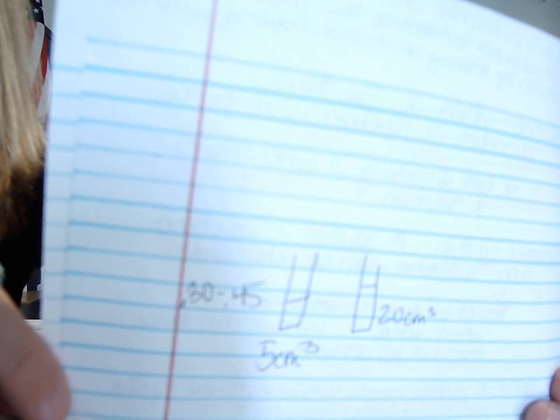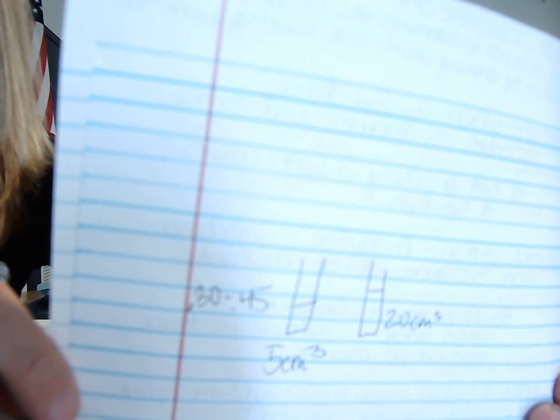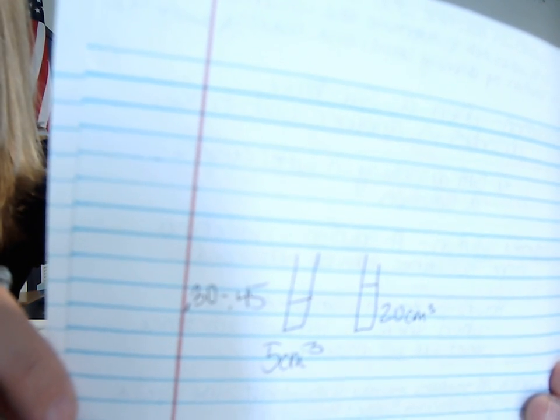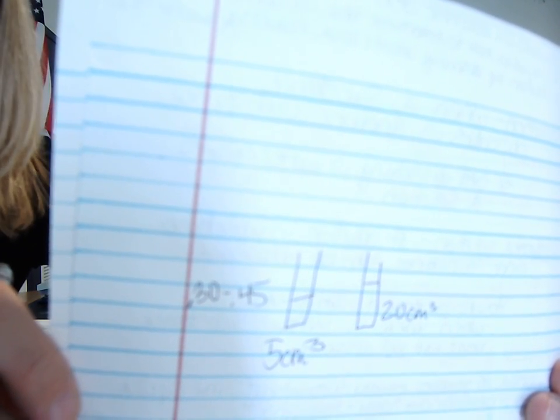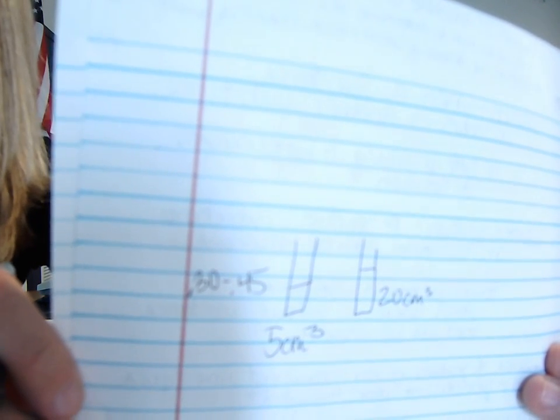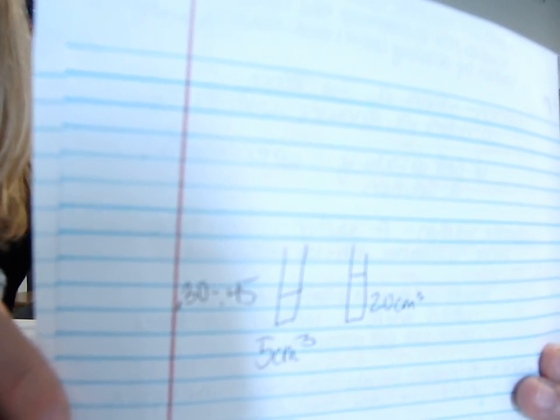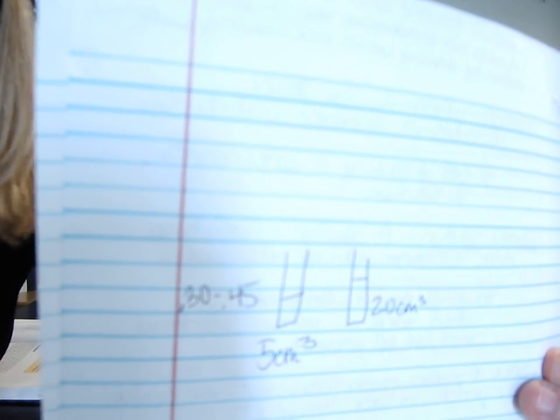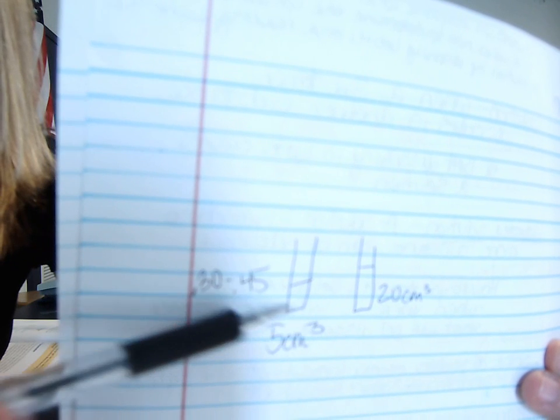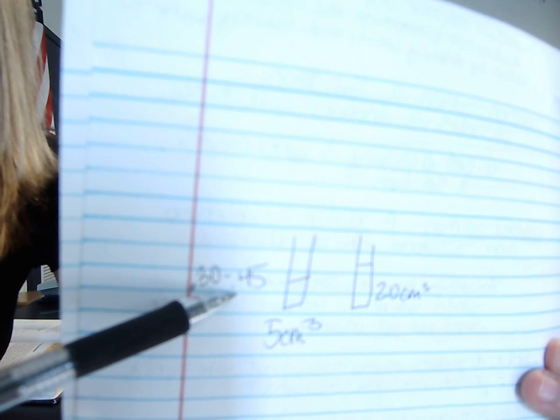Okay, if you look at the one on the left, it says 0.30 to 0.45. The point I'm making here is that when I put in 0.3 grams total in the 5 cubic centimeter side, all of it dissolved. However, when I added another 0.15, some of it was left undissolved. So I don't really know the exact amount that has to be added to where it's saturated. I just know it's somewhere between 0.3 and 0.45.